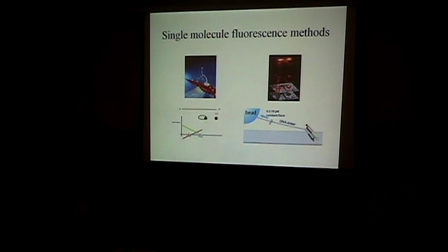Okay, so now I want to move on to the next topic, super resolution imaging. There are two competing technologies with two different acronyms. One is called PALM, the other one is called STORM. PALM by Eric Betzig and STORM by Xiaowei Zhuang.